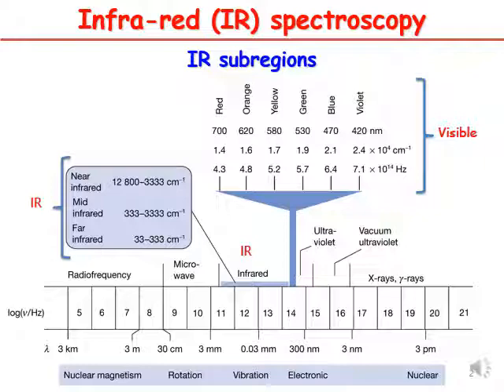Okay, so according to this electromagnetic spectrum, you can see that infrared is in this range. So most of the molecules that absorb the energy from infrared will actually have this kind of what we call vibration.